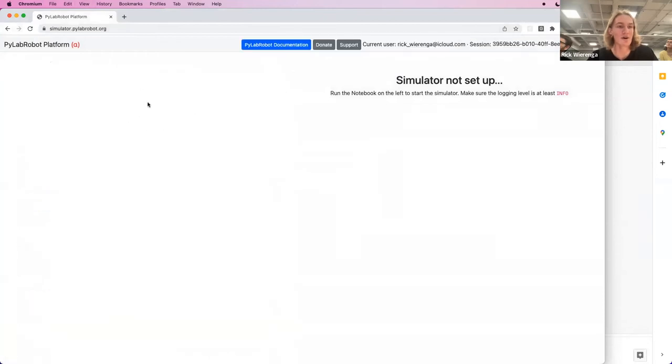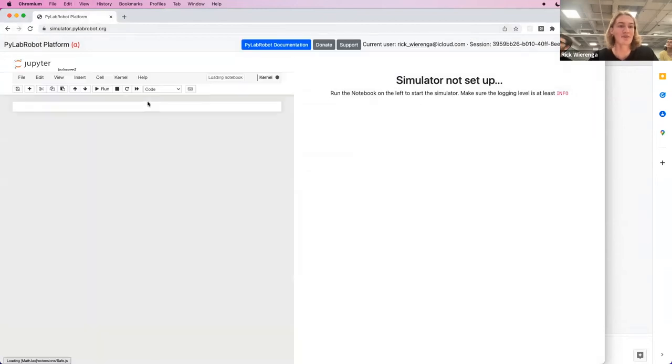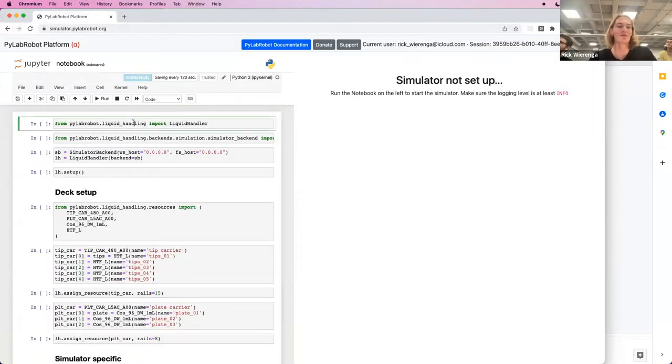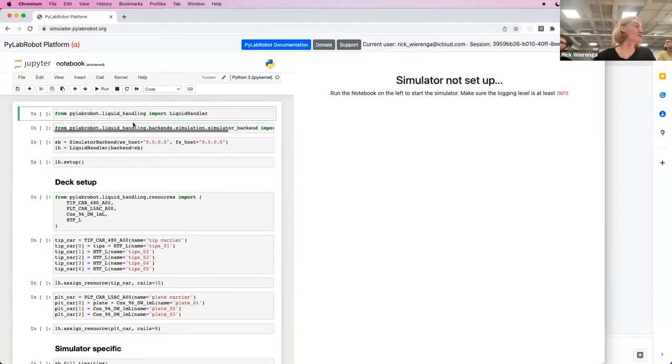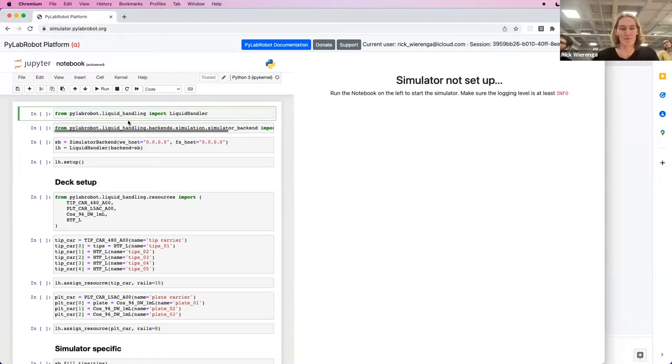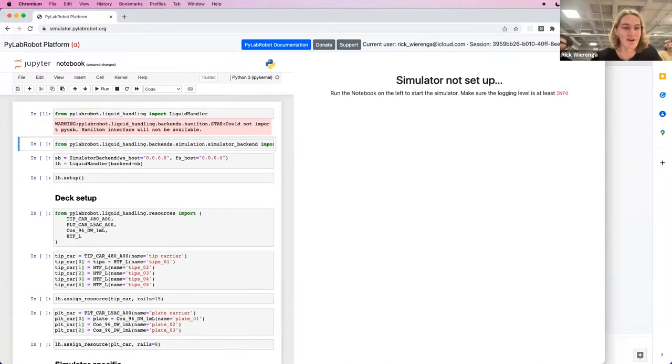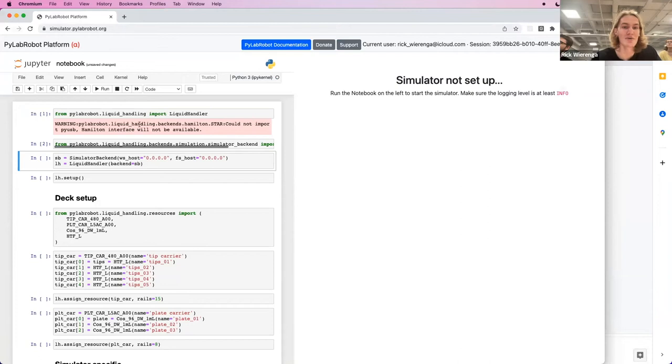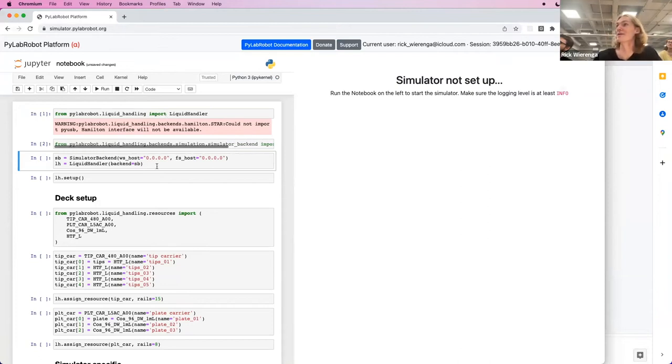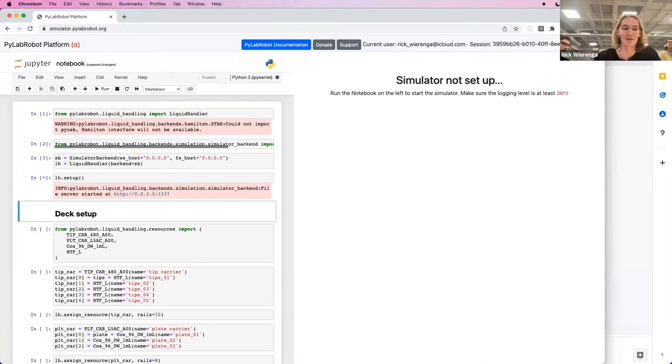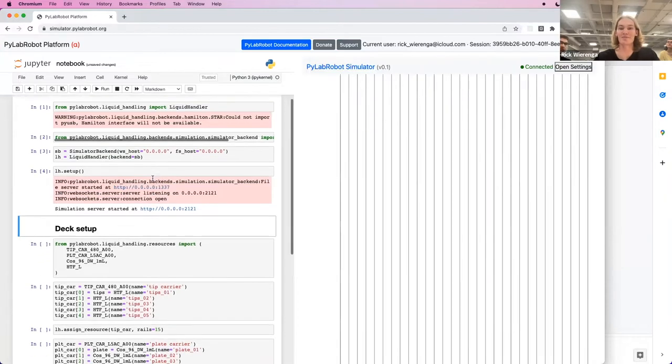This is the PyLab robot platform, which is a hosted Jupyter notebook that we run in the cloud. We start by importing the liquid handler and the simulator backend. Then we create those and set them up.